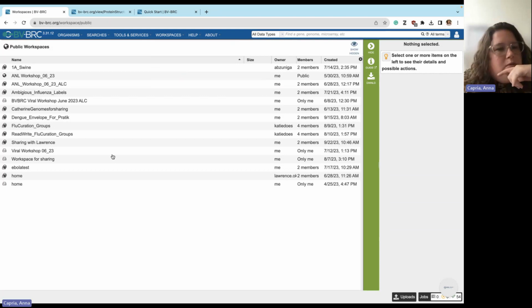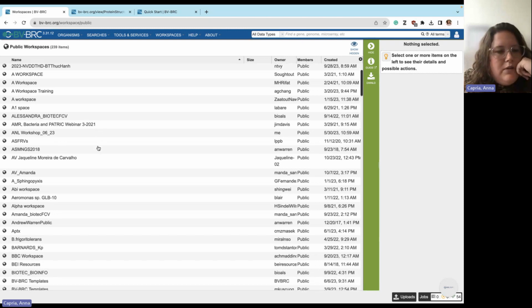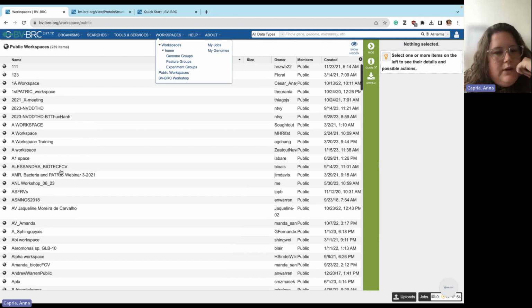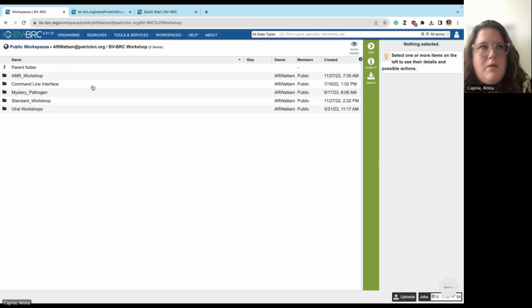We have public workspaces, which we recommend sharing things that are important, limiting the use of this unless it's something that you want to share with the whole BV-BRC community. But that's a good place to find some of our workshops, but the better place to find our workshops is here. So this will give you information about our past workshops, which will allow you to kind of search in there and find anything that might be helpful for you.